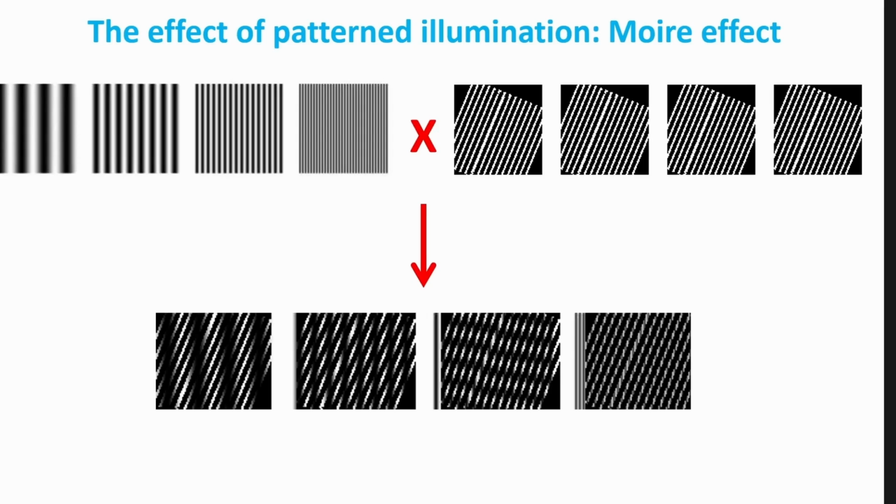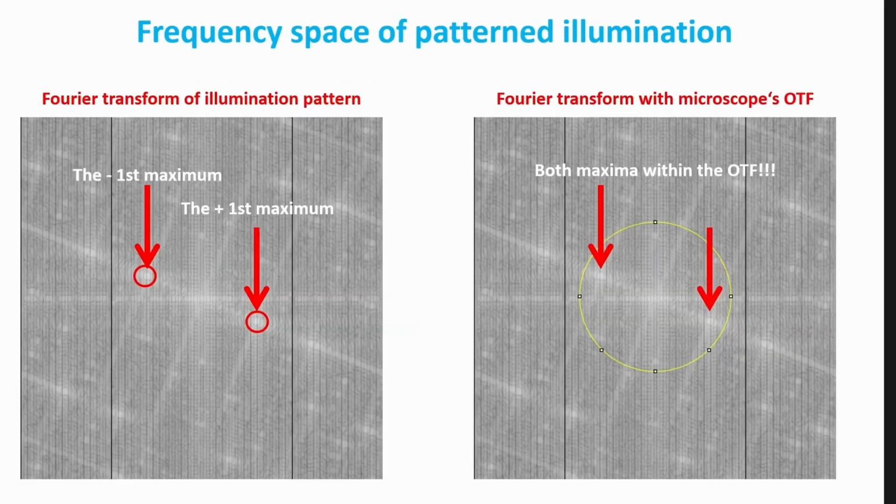And I didn't change anything, I didn't have to lower the spatial resolution, I didn't have to do anything. All I had to do was make a periodically transparent foil or a piece of metal or whatever, and illuminate my sample with that. I generate a Moiré pattern, and now if I put this through the microscope, I can see it. So what did I do?